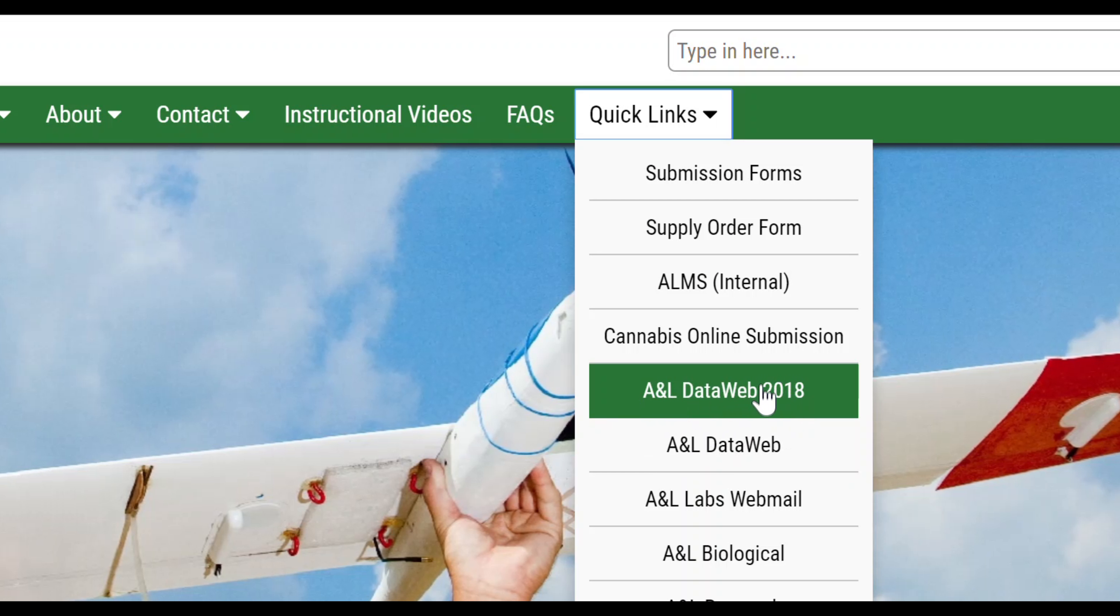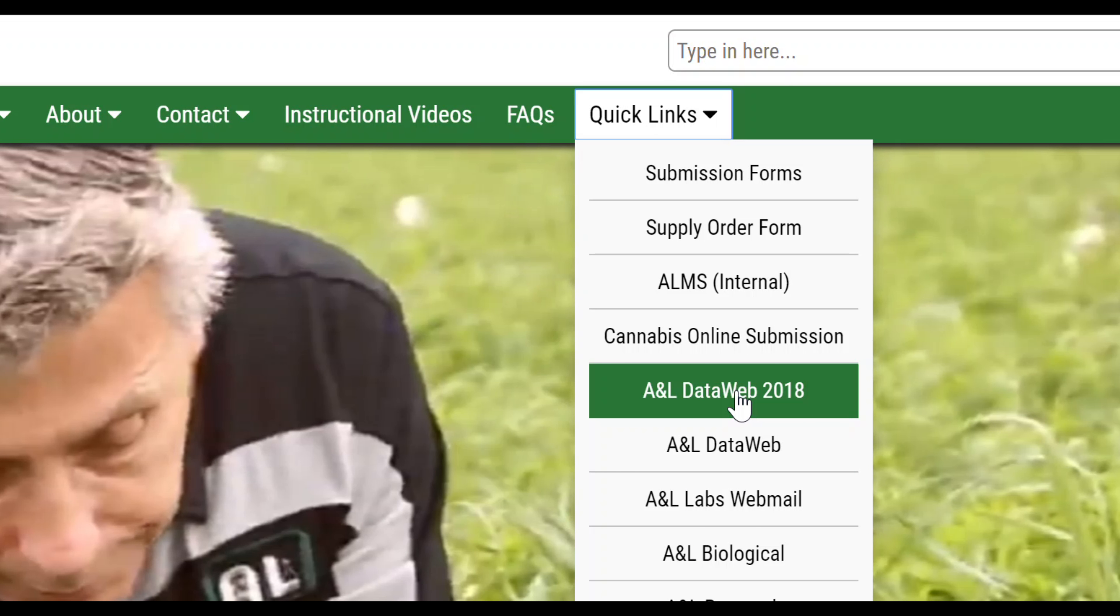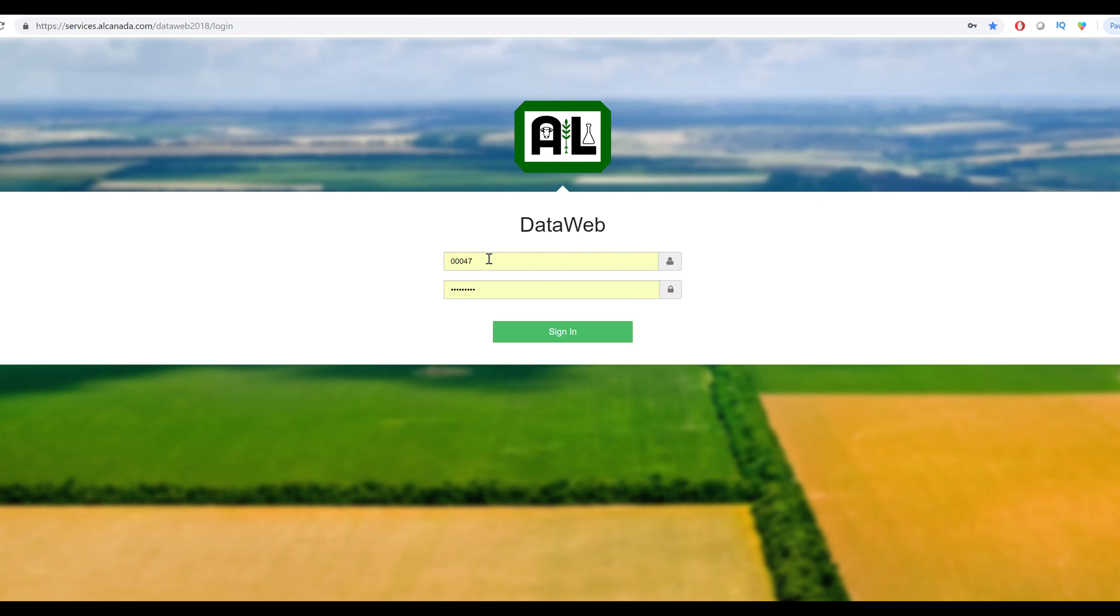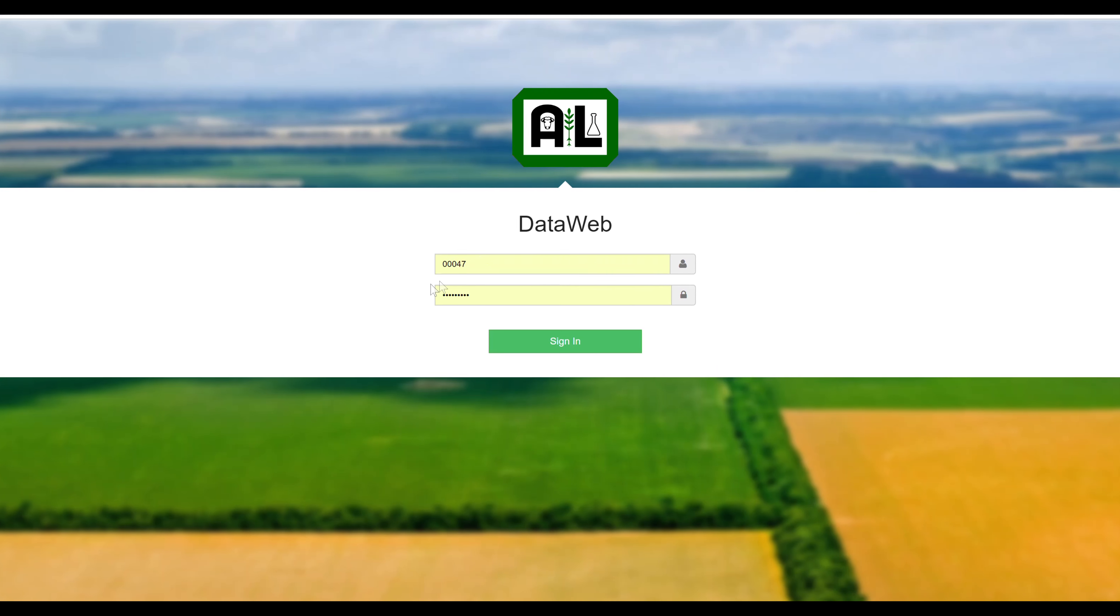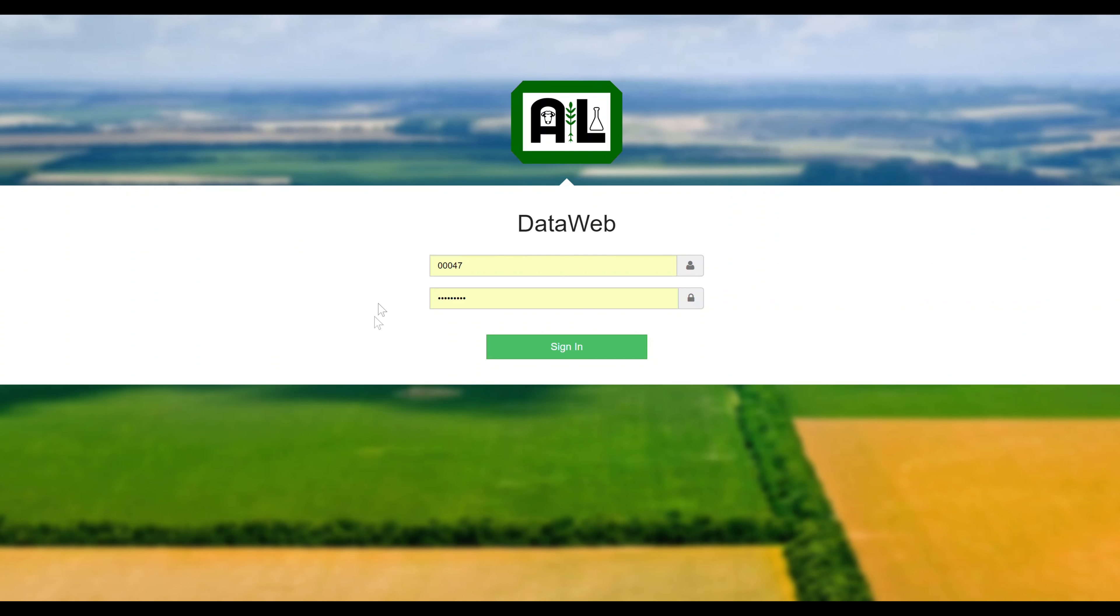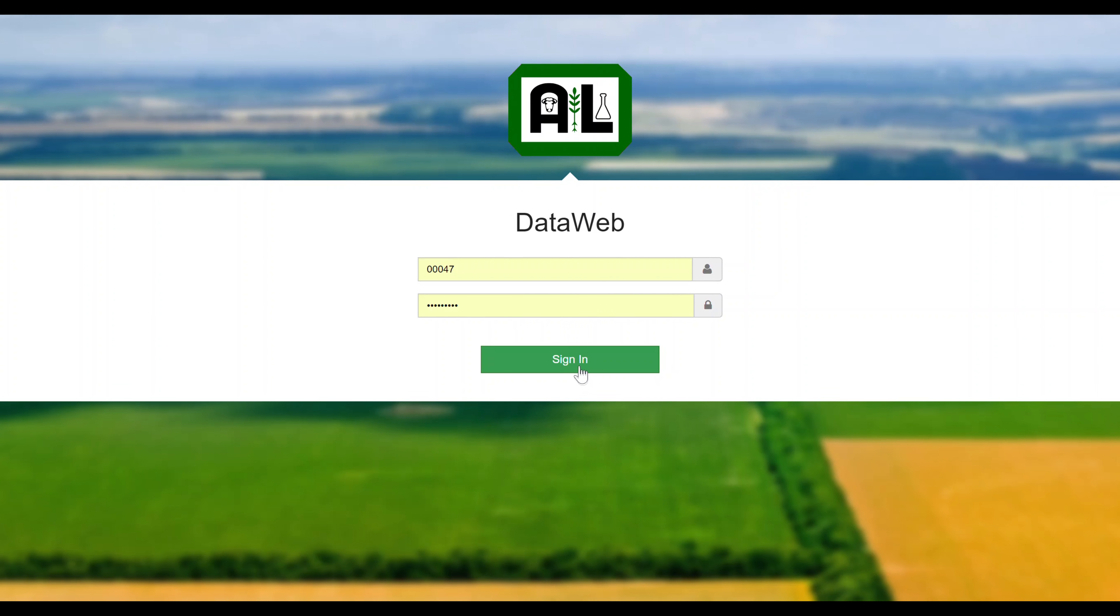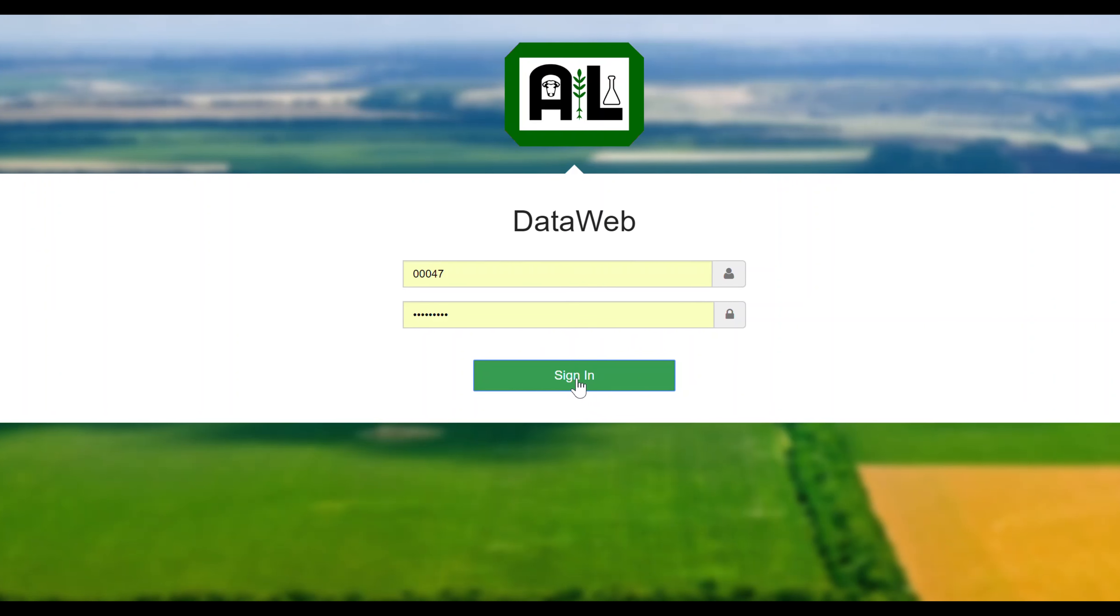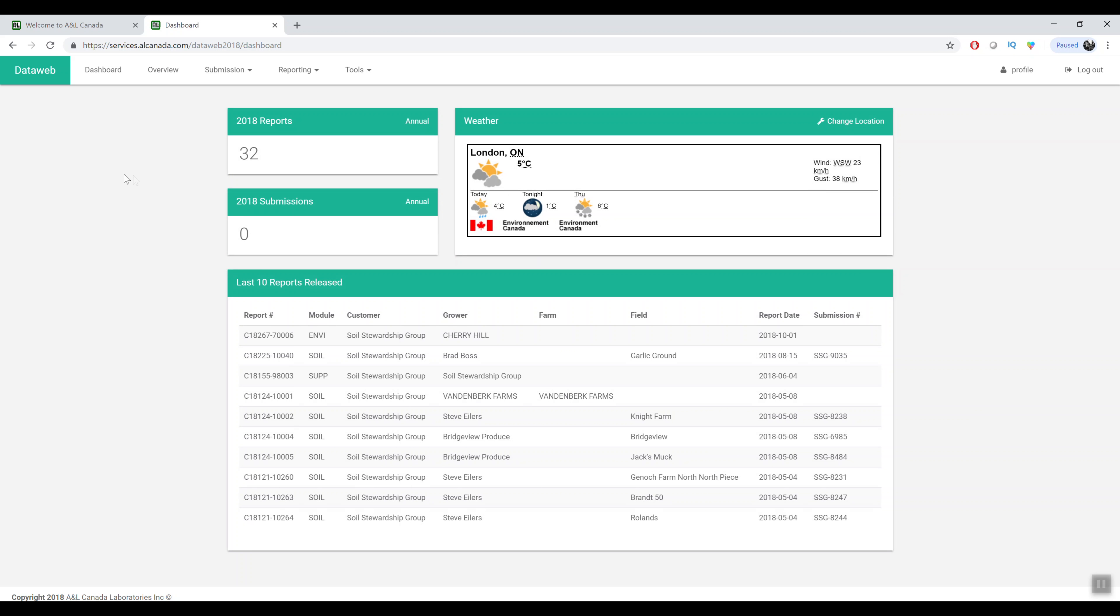We are still running the existing DataWeb in parallel but we encourage people to try out the new 2018 version. If you click on that, your existing username and password will work to log in to the new version of the DataWeb.